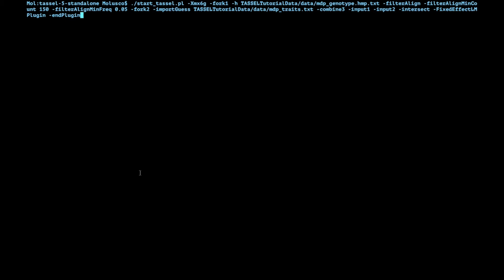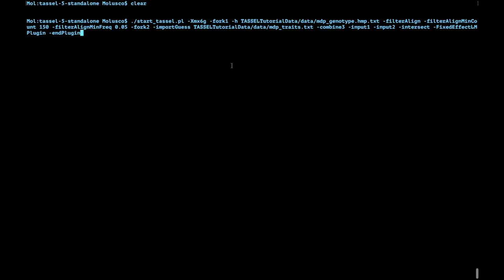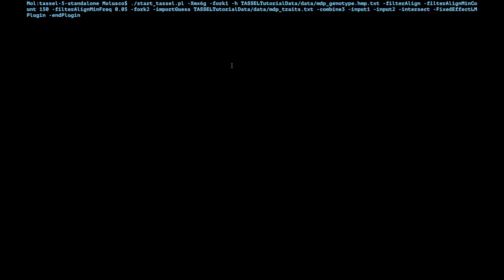So we have the start_tassel first, then we allocate the amount of memory we want to use. In this case we're going to use six gigabytes and then we start a fork. In this case it says fork one. This particular string can be anything, can be fork geno or fork G, really it's just a string so that you can use that information later on. In this case it's just one. Then it has a dash h which means that we're going to read a HapMap file. TASSEL in the standalone contains tutorial data under TASSELTutorialData/data and in this case the HapMap is called mdp_genotype.hmp.txt.